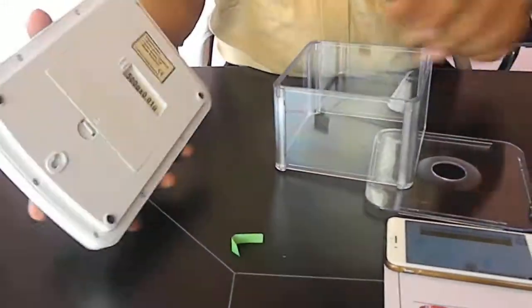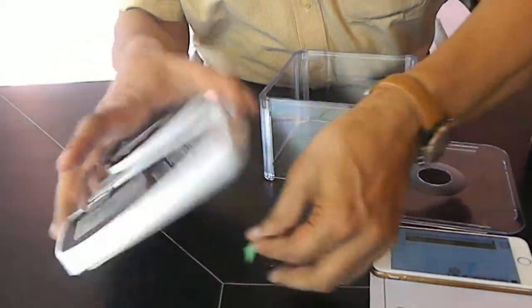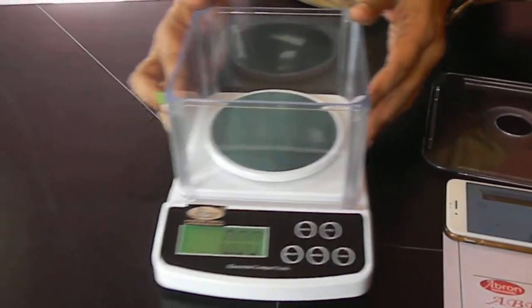There is a balance which has on the cells there is one slip. Take it out. It starts working. This is a chamber you can put here.